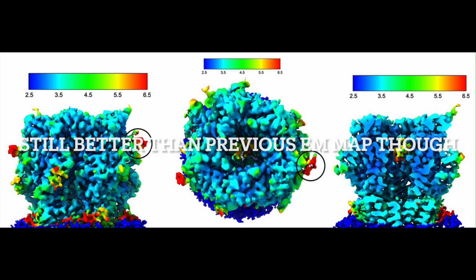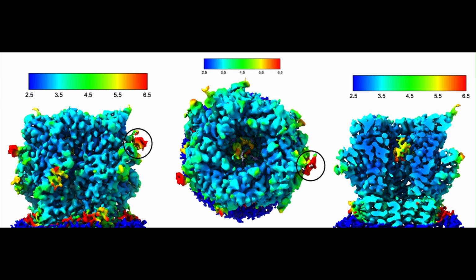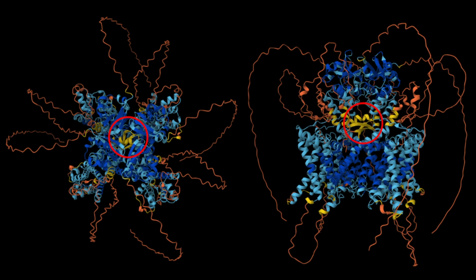It's roughly 6.5 angstrom, maybe around 5, something like that. Not really super awesome. But something that's also interesting to point out is when we look down the middle there, we saw that there's actually something hanging out in the middle of the pore, which, if you remember at the very beginning of the video when I was talking about AlphaFold, brings back that potassium channel, where AlphaFold thought that OSC1 could potentially bind the middle of this potassium channel.